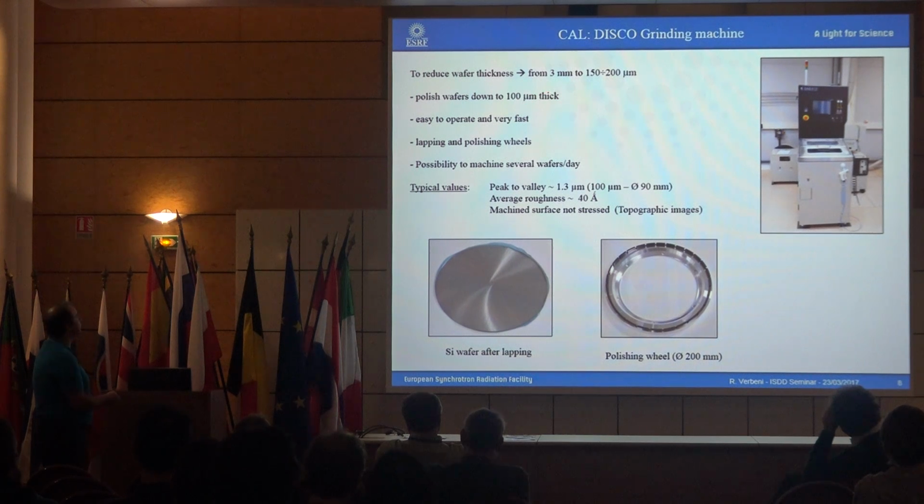It was a pretty nice wafer. This machine is very easy to operate and very fast, so we can polish several wafers per day. We have two wheels here, one for the lapping and the other for the polishing. You can see the teeth tested for polishing.